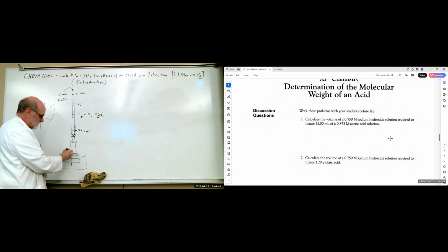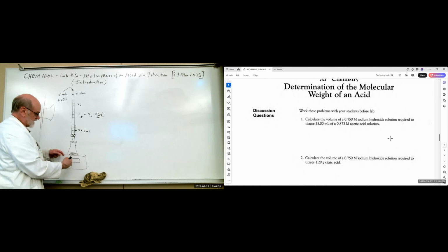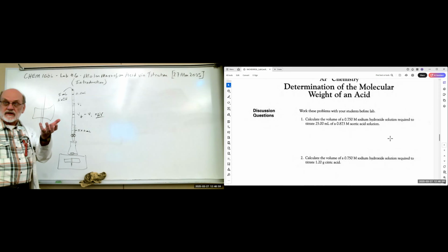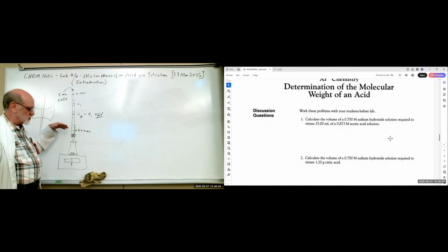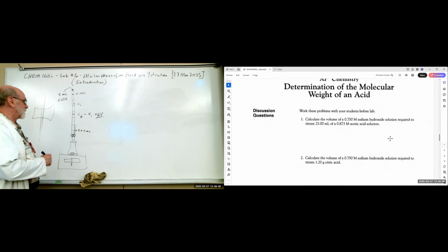And inside there, we're gonna have a Teflon coated magnet that's magnetically coupled to that big thing. And it's going to get it spinning, and that little magnet is inside your container, and it's mixing continuously. So you can let it just sit there. You can add a few drops and watch what happens. Okay.